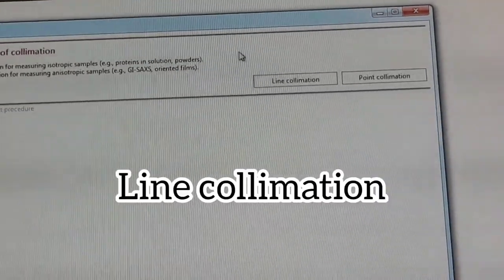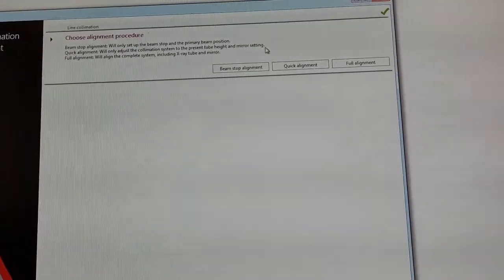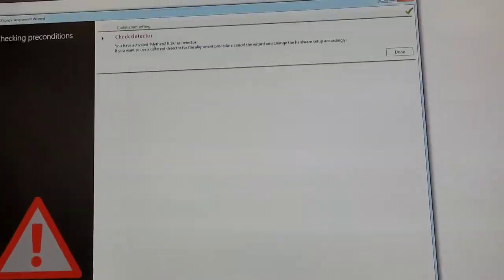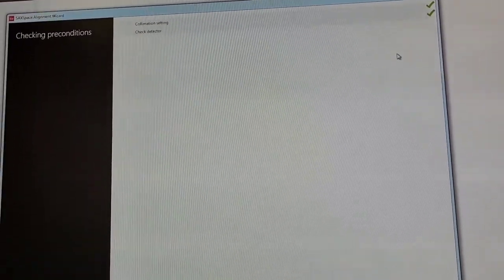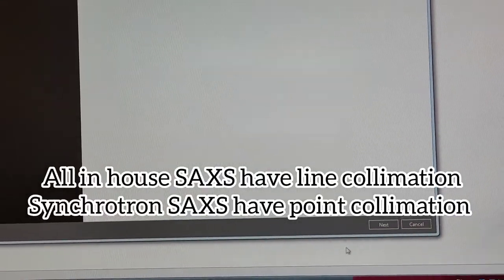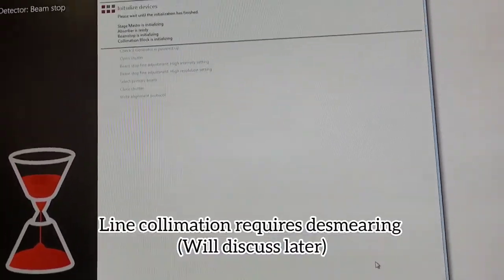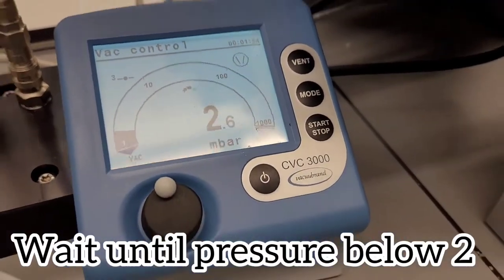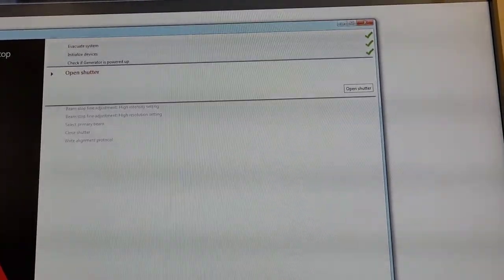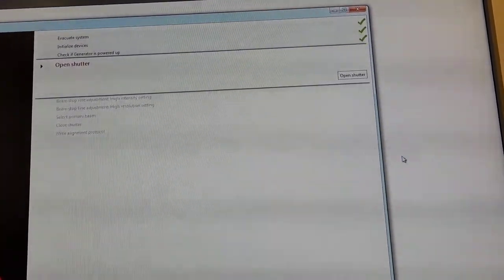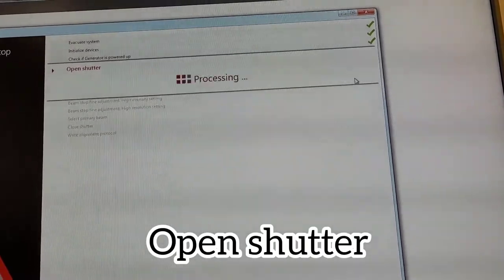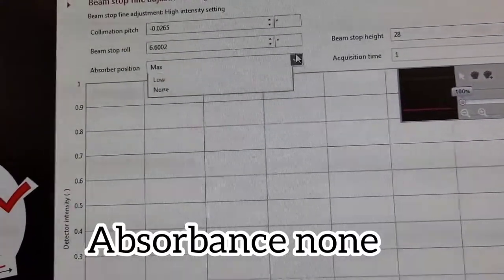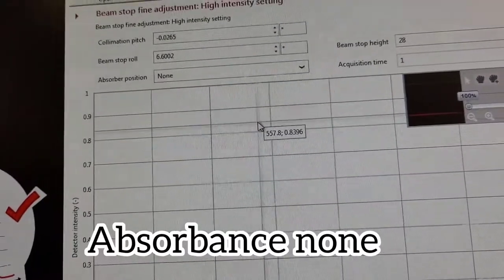Before anything we have to do beam stop alignment and select line collimation. Most of the in-house SAXS instruments have line collimation but the ones at other beamlines have point collimation. With line collimation in the processing we also do something called de-smearing, and I will talk about that later in detail.